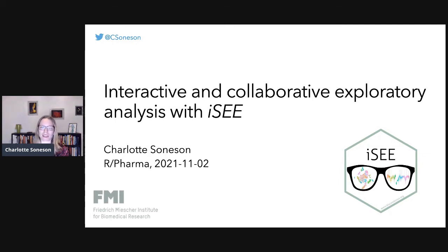So thanks a lot for giving me this opportunity to talk to you today about iSEE, which is an R package built on the Shiny framework that lets you construct flexible interactive applications where you can basically explore any type of rectangular data, including biological data, and also share these insights with your colleagues.